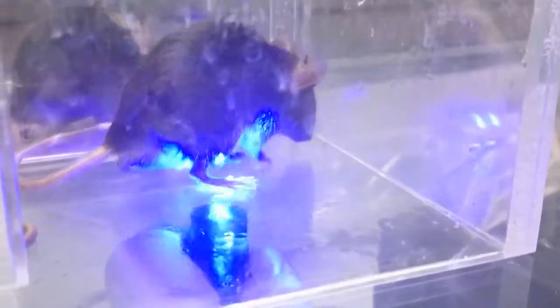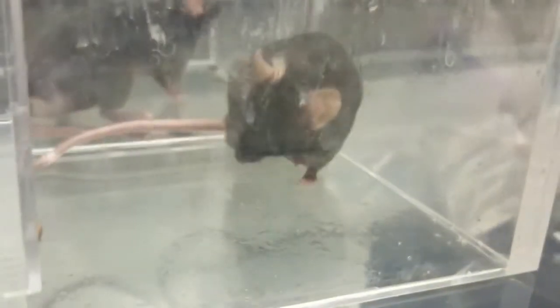This is the ipsilateral paw, and now contralateral — no reaction at all. This mouse also received a double dose injection. Contralateral: no reaction. Ipsilateral?